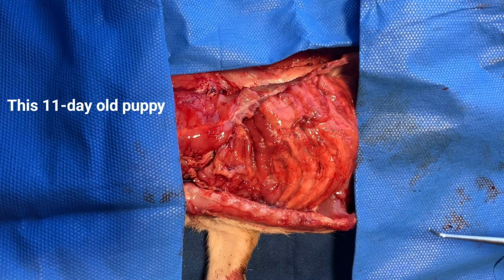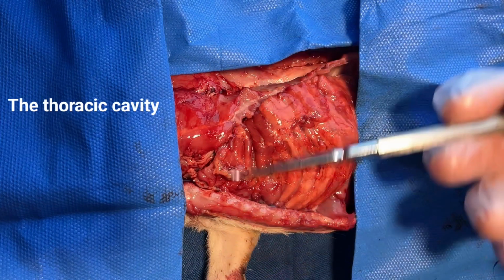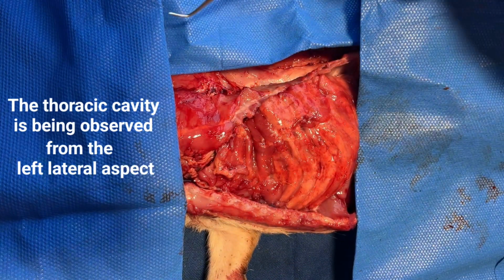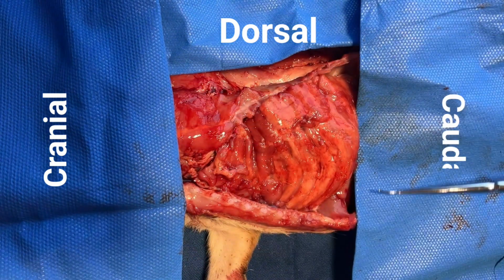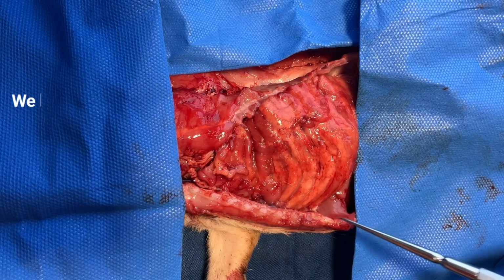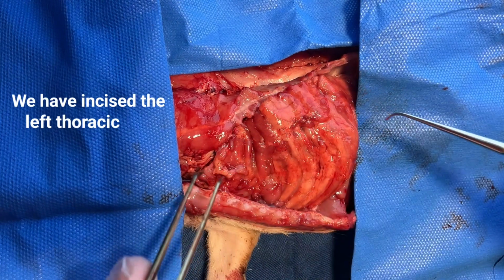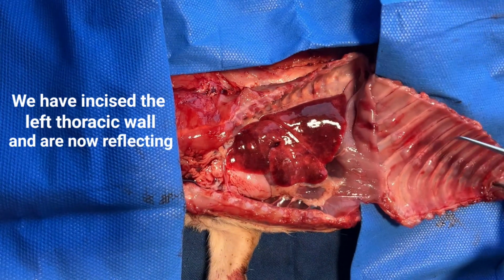This 11-day-old puppy died from internal hemorrhage caused by trauma. The thoracic cavity is being observed from the left lateral aspect. This is dorsal, this is cranial, this is caudal, and this is ventral. We have incised the left thoracic wall and are now reflecting it caudally.